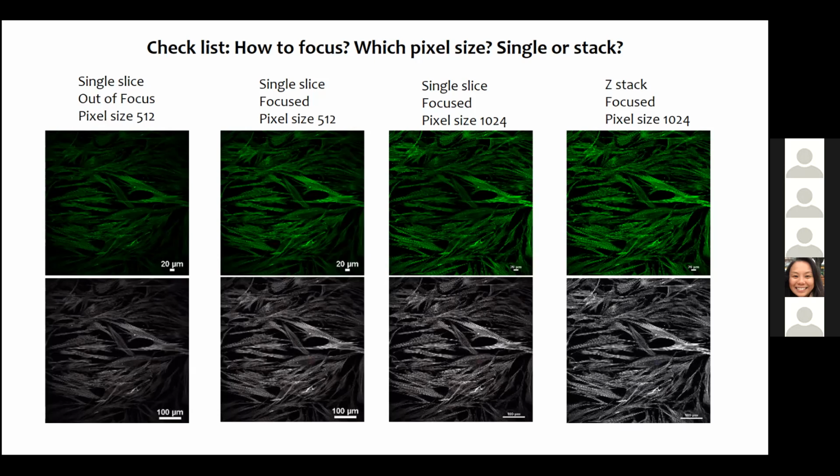So the brightness is basically going to tell you, between a treated and an untreated sample, whether or not your protein is overexpressed or underexpressed, or if you've treated it with some kind of a drug and you expect the protein to get degraded or whatever it is.